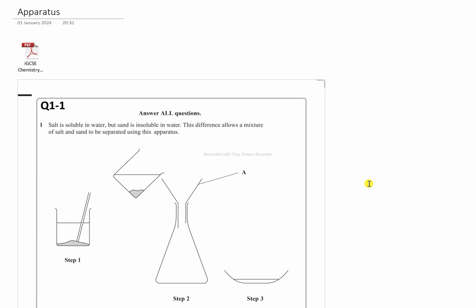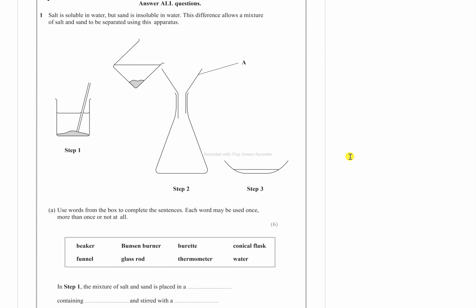We're going to quickly look at this apparatus topic sheet. Alright, so let's get going with this. Right, that there is your beaker.